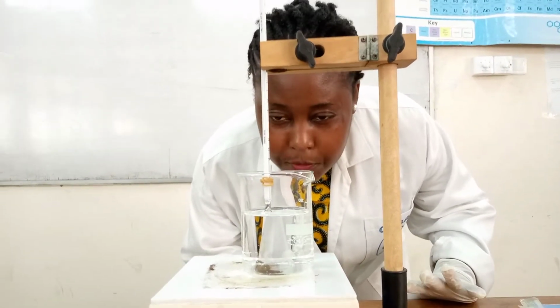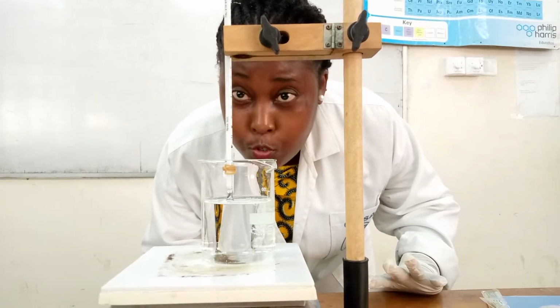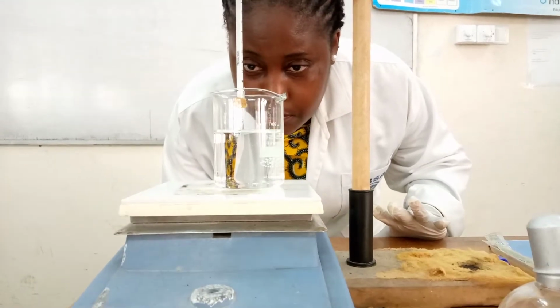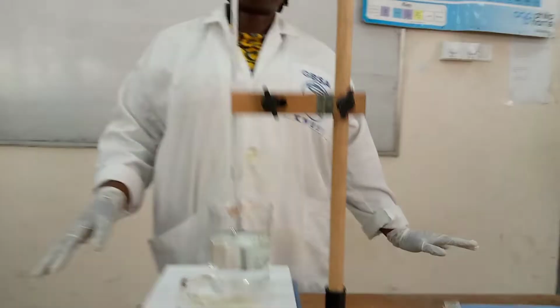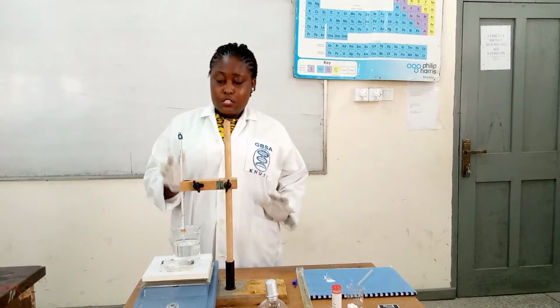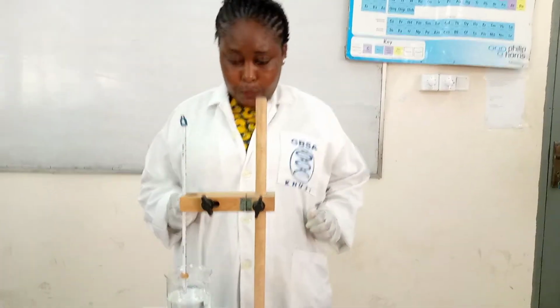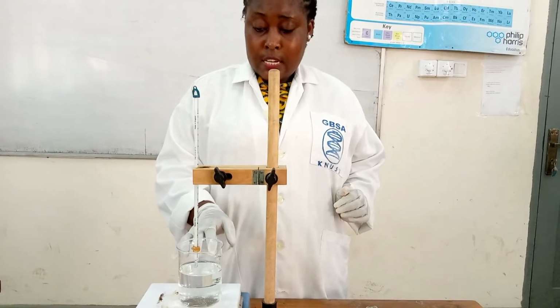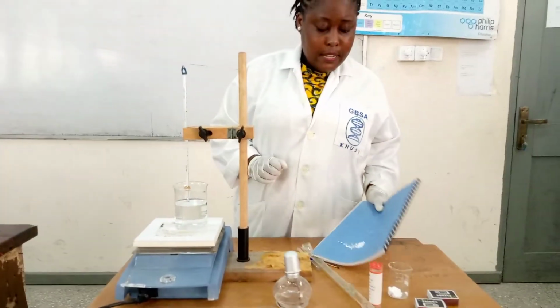So your eyes have to be fixed on it. As you are watching the sample in the tube, then you'll be looking at the readings, the calibrations on the thermometer. Yes. So at this point, you can take a lab stool and sit on it and continue to observe. So this is how we determine the melting point. So yeah, because the paraffin oil is already hot, it is about to melt. So I need to record my temperature.